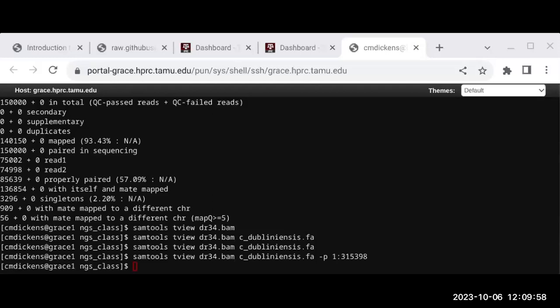So what's a biocontainer, or a container, or an image? Basically, some software is very complex to install. It has all these dependencies. You have to have specific versions, and you have to have these databases configured, and to install it can be a pain, and sometimes almost impossible to replicate the way they installed it. And it's just too much time. But hopefully they provide a container or an image, a Singularity image or a Docker image, so that basically it's all packaged into one image, and you can use that image to run the software. It's already installed in this image.